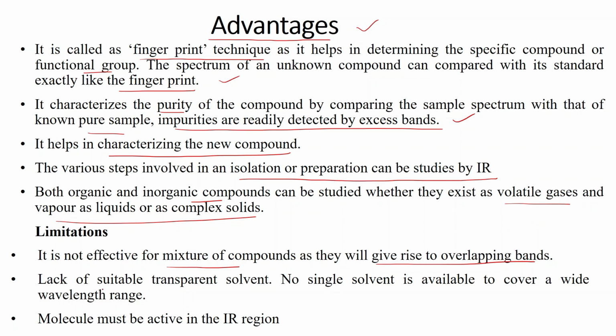There is a lack of a suitable transparent solvent. No single solvent is available to cover a wide wavelength range. The molecule must be active in the IR region. One of the most important requirements is that it should have a dipole moment, and there should be a change in the dipole moment when the bond or functional group is vibrating. It must cause a change in the dipole moment, then only will your molecule be active in the IR region.